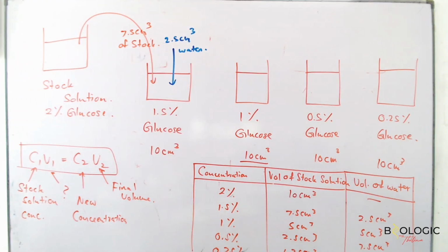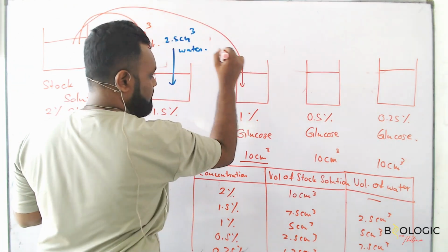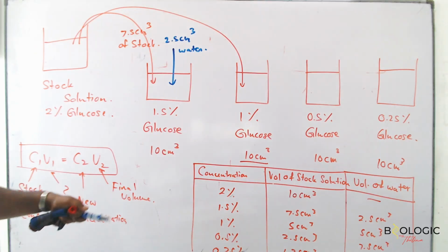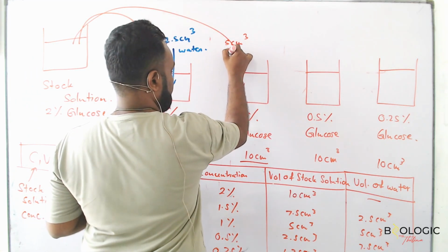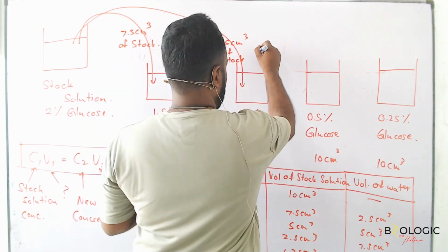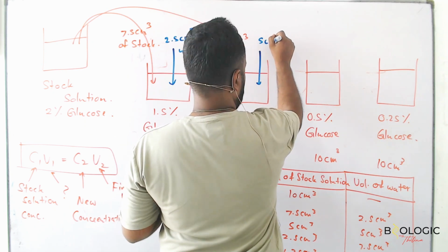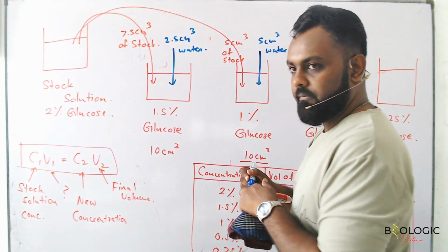Like that. Then to that one, 5 of this, five of water.